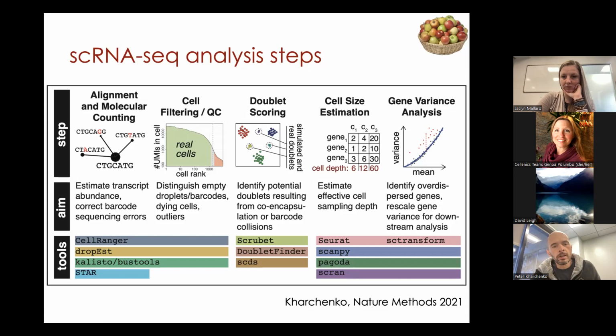So you encounter a number of reads, and many of these reads have this particular barcode, but then some of the reads have a barcode that differs by one letter, right? And so this particular heuristic algorithm connects the barcodes that differ by one letter by an edge, and then at the end, after you've gone through all the reads, for instance, in this library, you simply look for connected clusters like this, and you collapse them into one molecule, right?